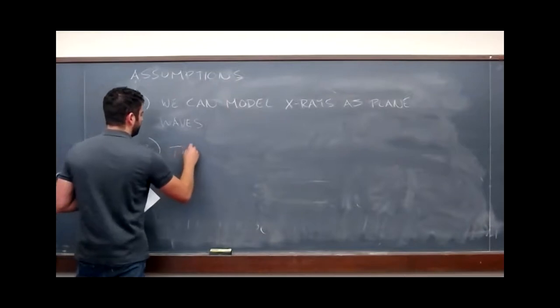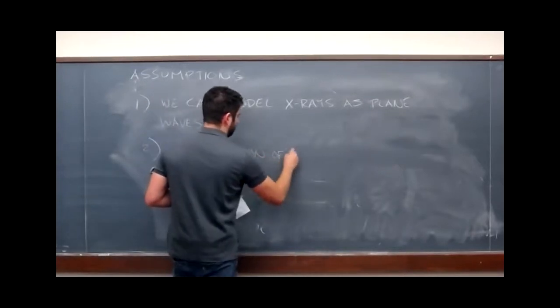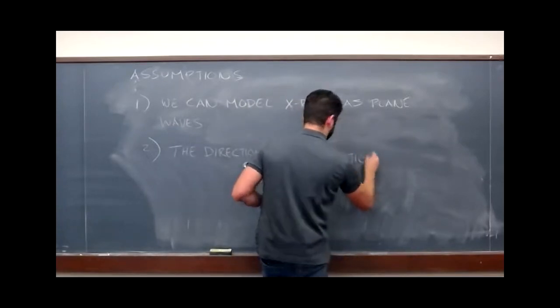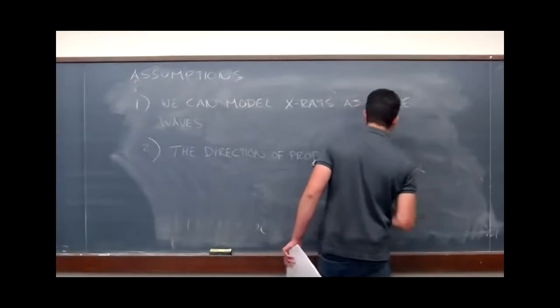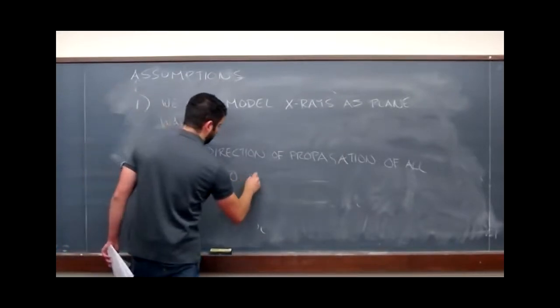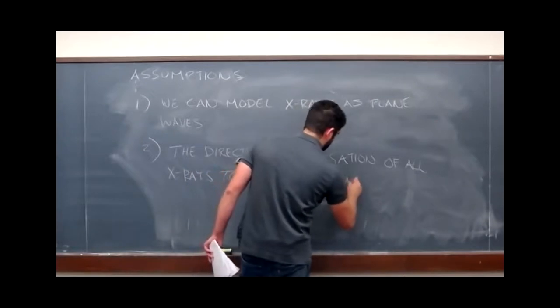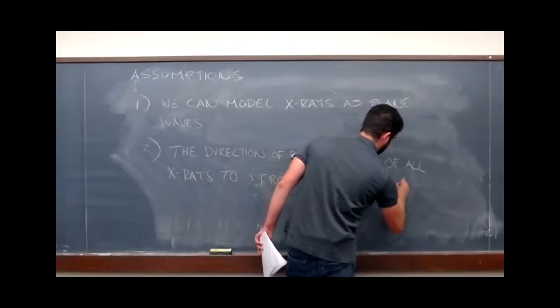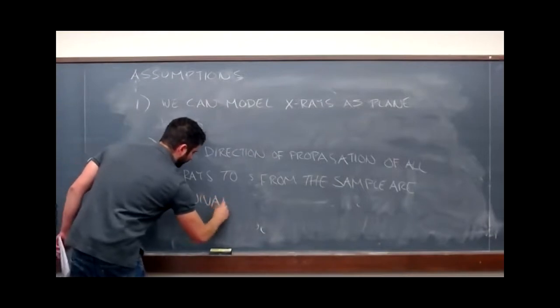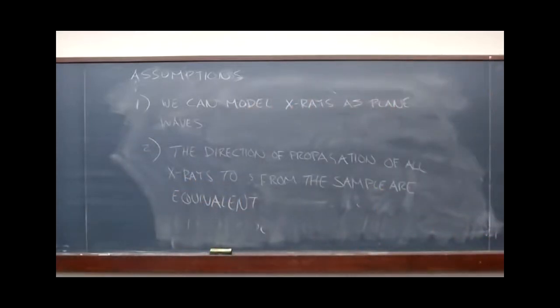Second, the direction of propagation of all X-rays to and from the sample are equivalent. So what do I mean by that? So I'm going to try something new right now. I think my drawing skills are going to fall apart at this point in the class.